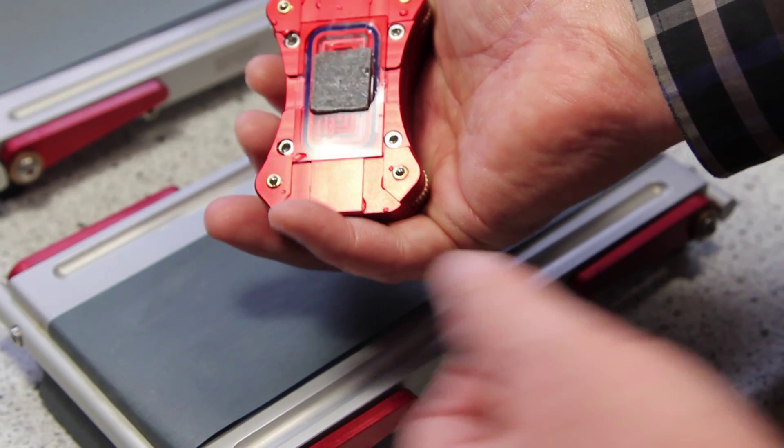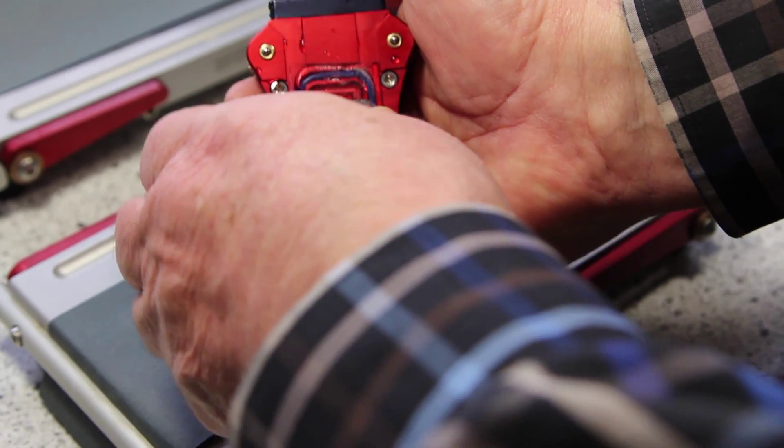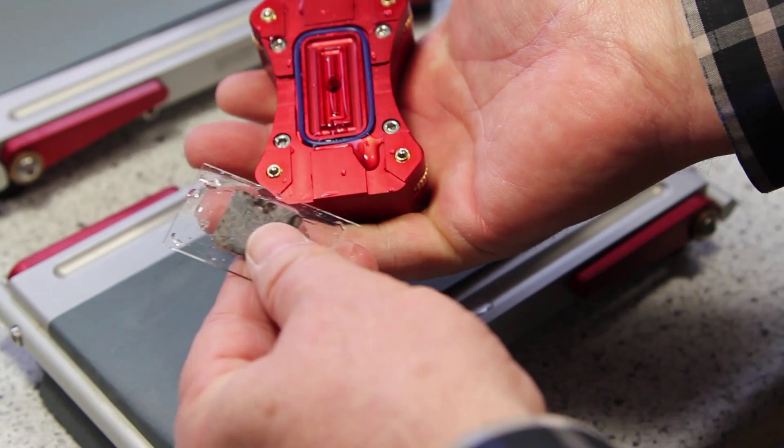And now I press the button and I take the sample out of the thin section mount.